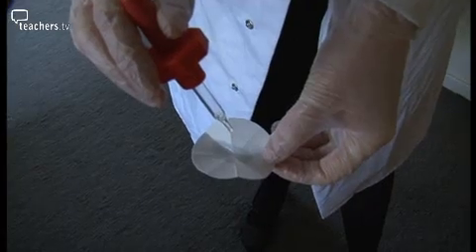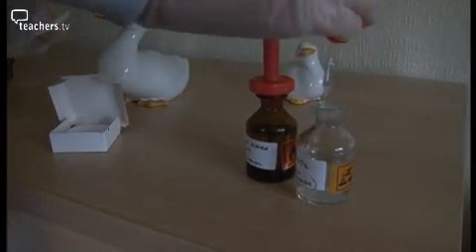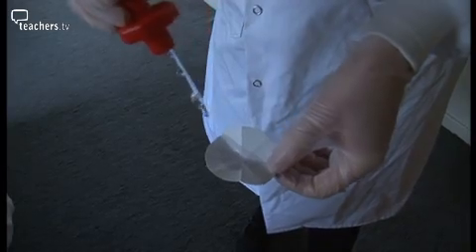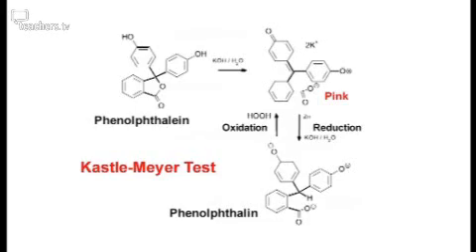The Kastle Meyer test reacts with the haemoglobin in blood. And it's actually something within the haemoglobin that's called peroxidase activity. So peroxidase is an enzyme, the enzyme within haemoglobin. What will happen is the peroxidase activity within haemoglobin and blood kickstarts or catalyses the reaction, or decomposition, if you like, of hydrogen peroxide. So hydrogen peroxide will react with this blood.